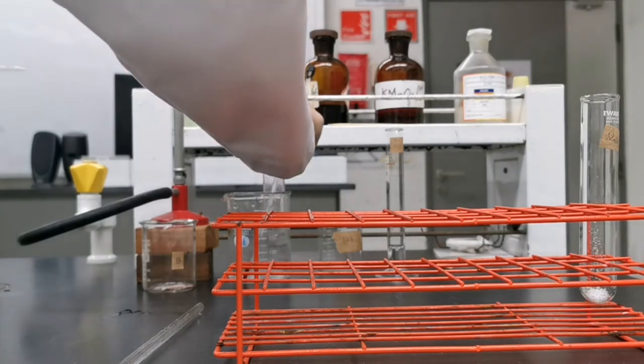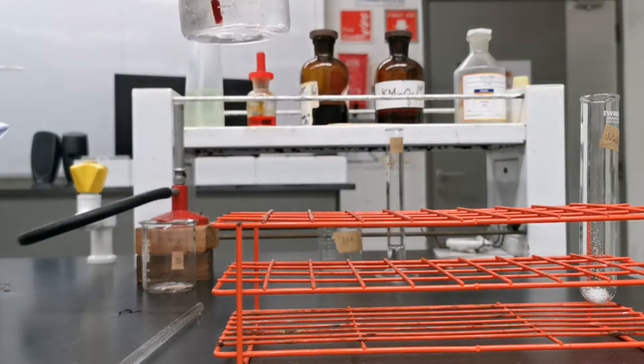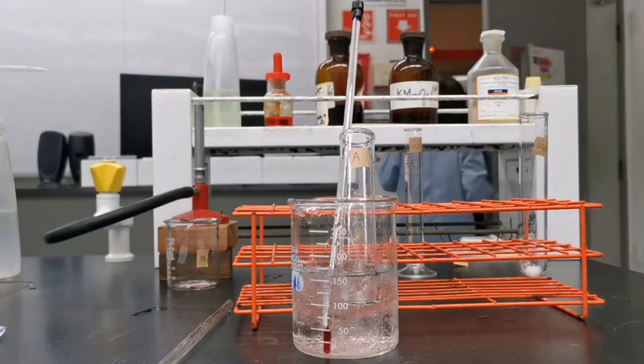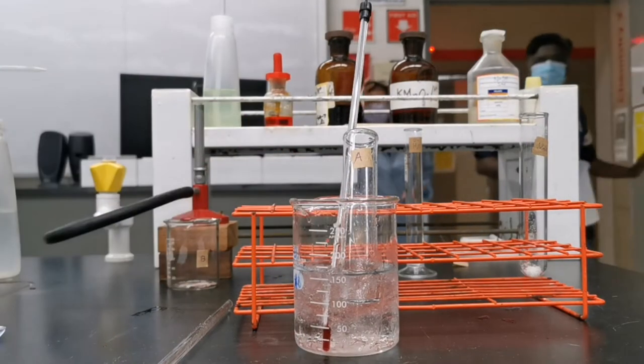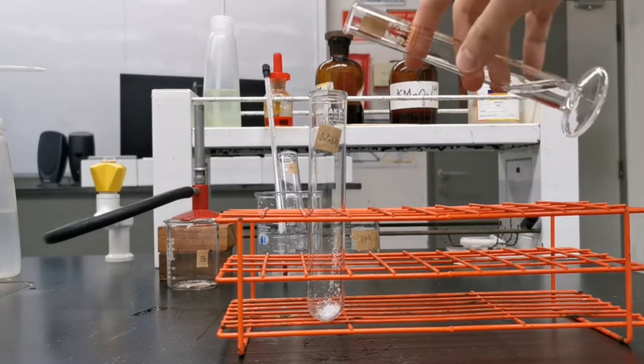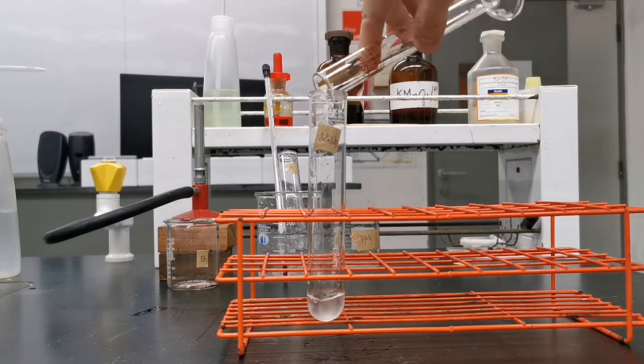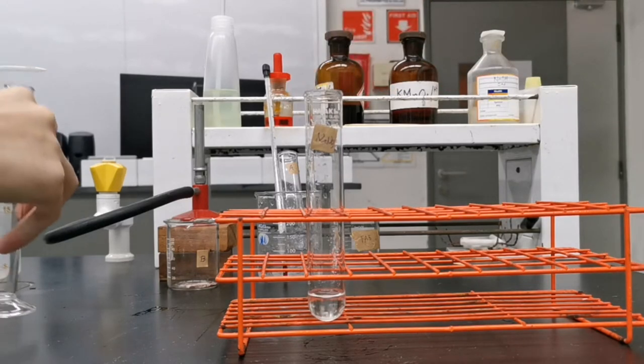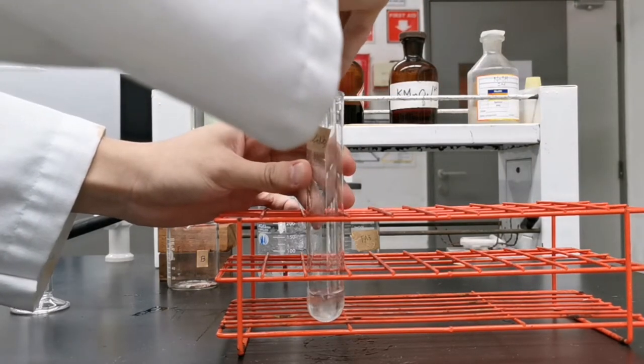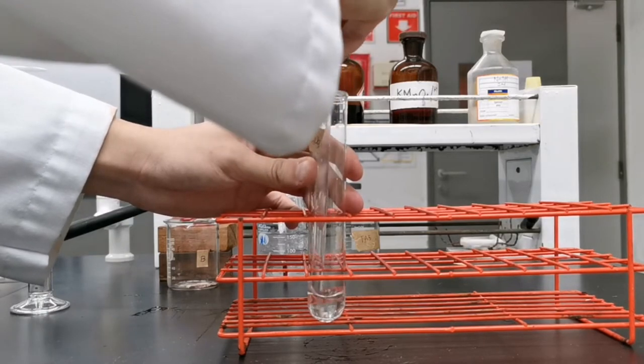This is to ensure the mixture has the same temperature as the ice bath. I then pour 5 mls of distilled water into the sodium nitrite, making sure all of it is dissolved before placing it into the ice bath as well.